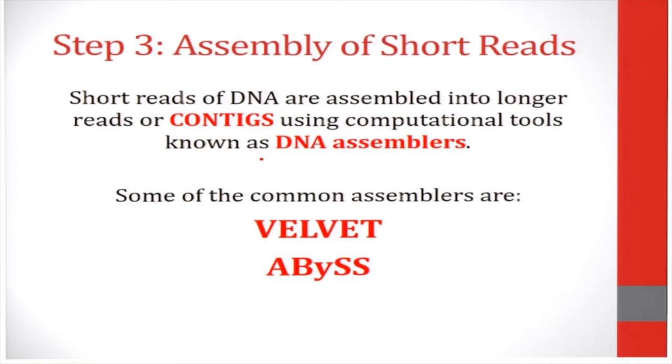The next step involves assembly of short reads. The short reads are assembled using software such as Velvet and Abyss. This software can assemble short reads into larger reads. Larger reads are termed contigs.